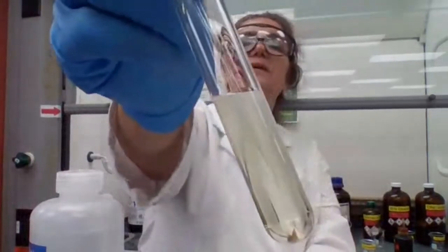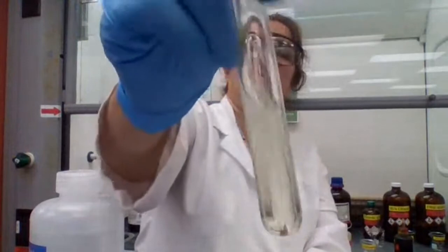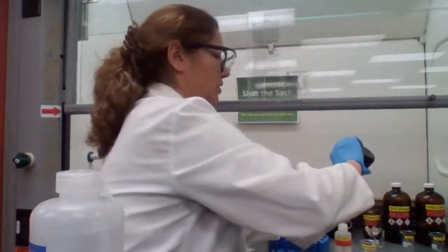Do you see the cloudiness? The particles that make it cloudy form as I'm adding iodine. It gives a yellow color precipitate.